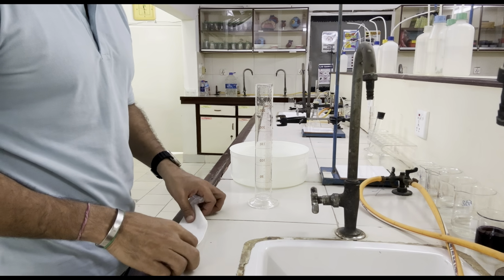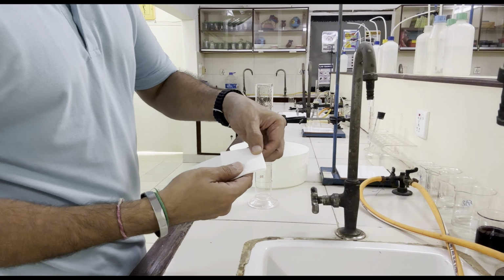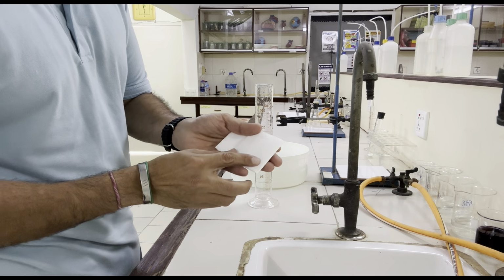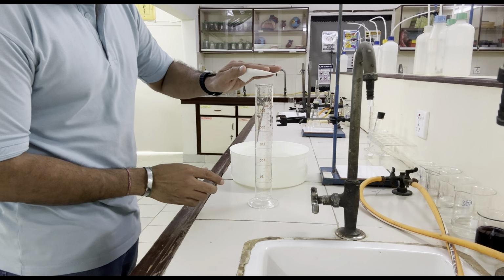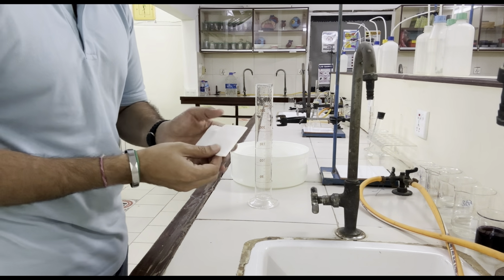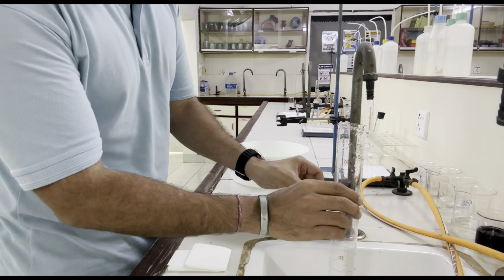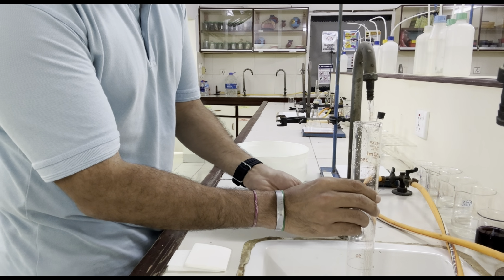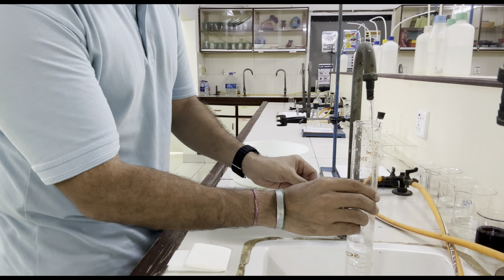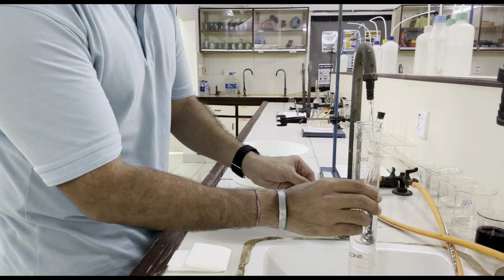First of all, we will take the paper towel and we will fold this into a smaller portion so that once I cover this measuring cylinder with this paper towel, this water must not fall because I have to flip this measuring cylinder. So I have taken it a bit thicker now. Let me fill this measuring cylinder completely with water. Now, one more thing to remember here is we have to fill completely. They have written in bold. It means it must be filled enough that there must be no air bubble left. Let me show you how.